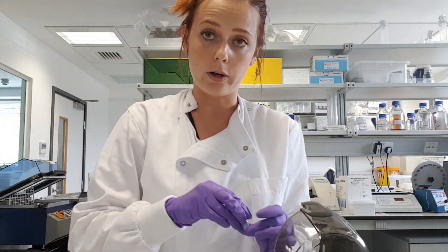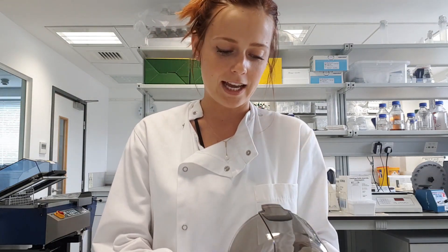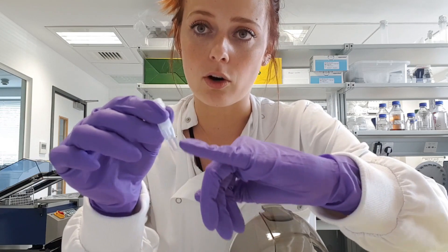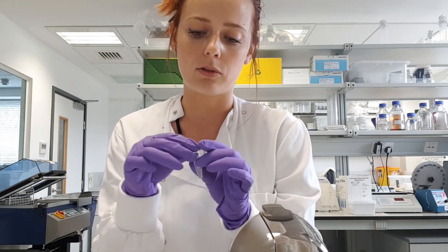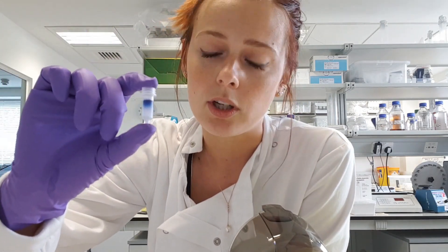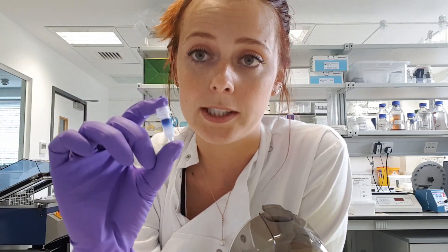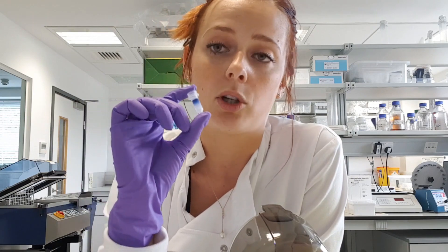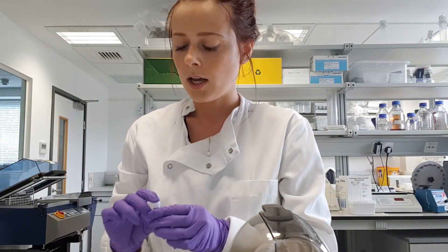Then centrifuge again for one minute. After this final centrifugation, you will see your 200 microlitres of purified exosomes, which are ready for any downstream application or can be frozen if needed. Regarding the column, you can see the dye continuing to elute through, but it remains retained near the top — this is what gives you a really pure sample. The column retains all proteins and small molecules, leaving you with highly pure exosomes.